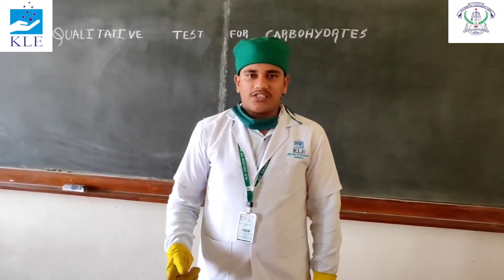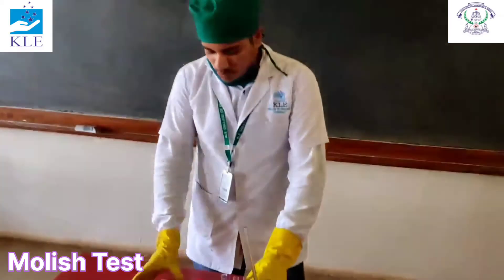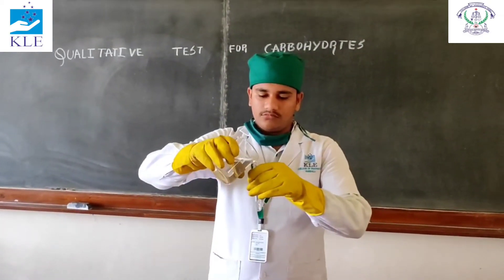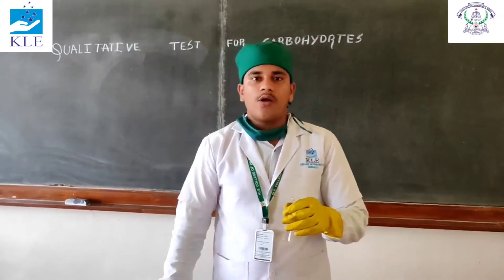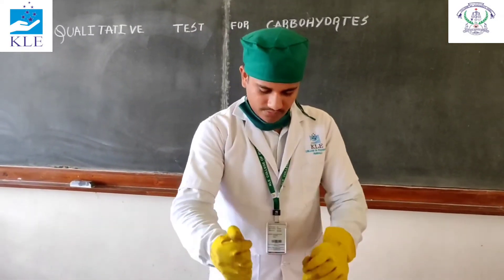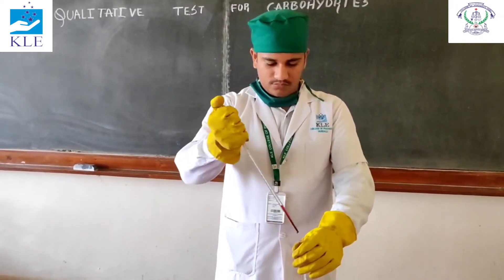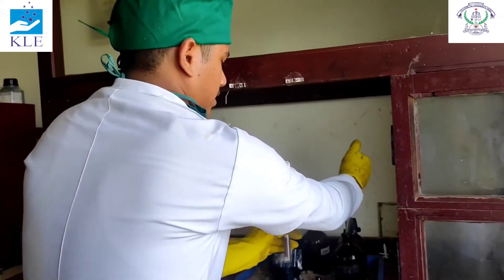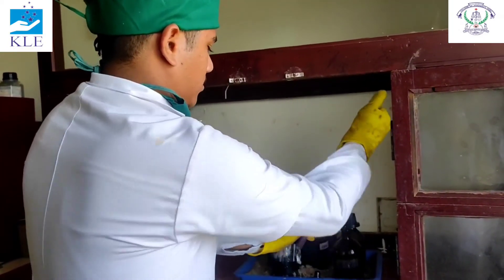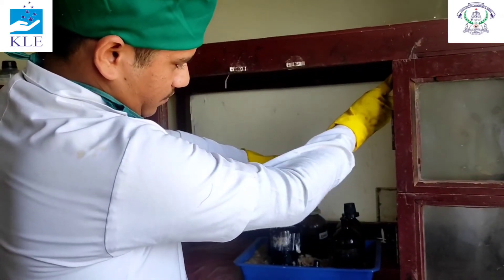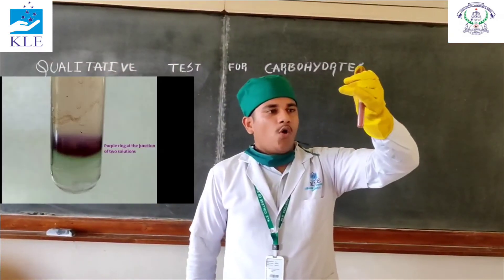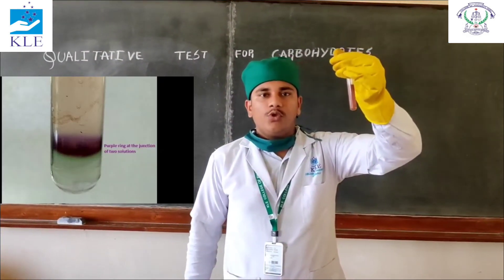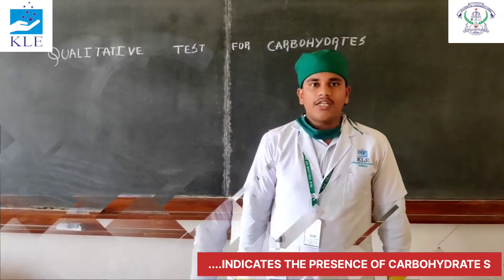First test — Molisch test. Take 2 ml of sample solution and add 2 drops of Molisch reagent, then add 2 ml of concentrated sulfuric acid carefully along the sides of the test tube. A violet ring will appear at the junction of the two liquids, indicating the presence of carbohydrates.